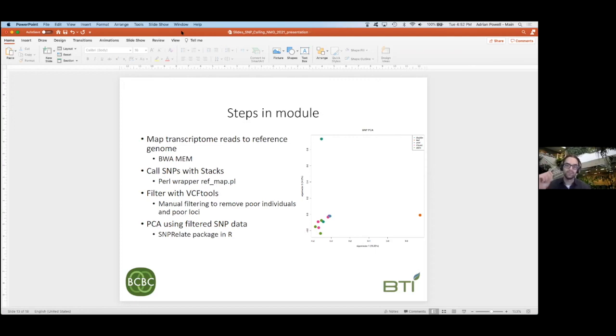So if you do things in that order, it'll affect the amount of missing data for that individual, right? So depending on the order that you do things in, it'll definitely change what you get. So maybe some caution is warranted as well.